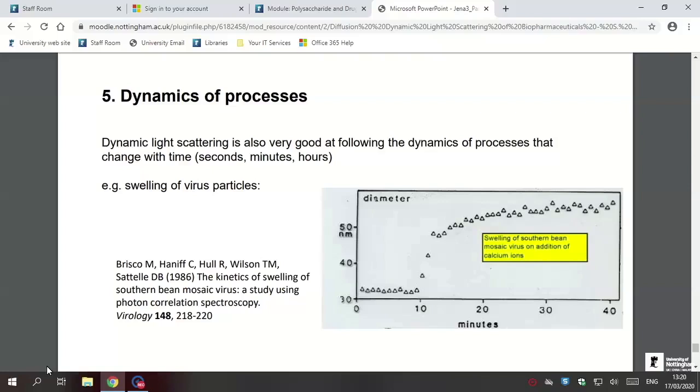And because the protein crystallographers use this method, from Dave Scott's lectures in the BIOS4005 module, you will have learned that many interesting proteins are stubborn non-crystallizers. They're very difficult to get to crystallize. You have to try out various combinations of solvent conditions to get them to crystallize. Well, DLS, dynamic light scattering, is a very popular way of seeing how successful these methods are, by looking for evidence of nucleation and change in size with time.